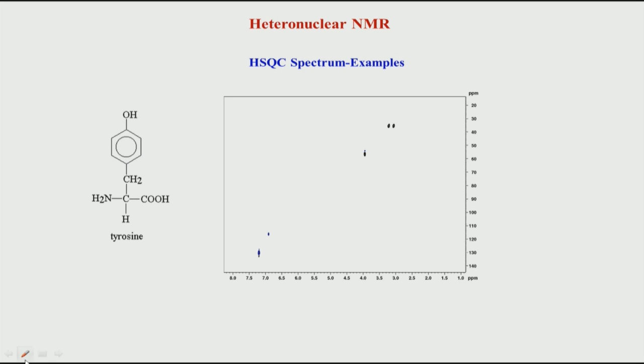But what happens is that this ring in the molecule rotates rapidly around this axis. So, let me show you that axis. There is typically a very fast rotation around this axis. Therefore, because of this fast rotation, the two hydrogens, the ortho protons, and likewise the meta protons, are equivalent. It is similar to what we see in the case of methyls.